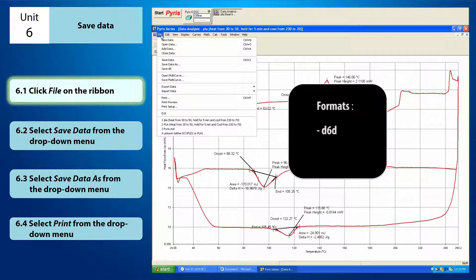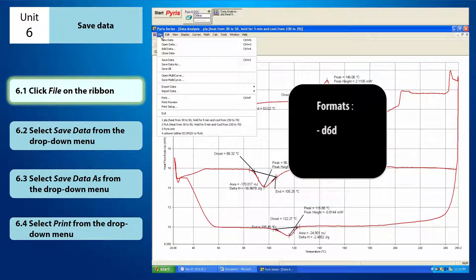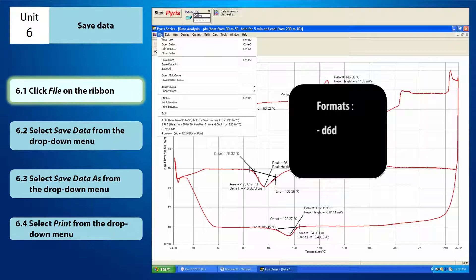It is a PIRIS data document and it can only be opened using PIRIS software. When you have entered the sample ID and selected the folder back in the method editor window, your sample has already been saved in D6D format. When you save your data in D6D format, you can reopen, edit and even further analyze your data.